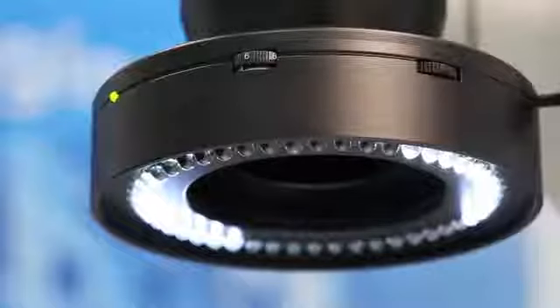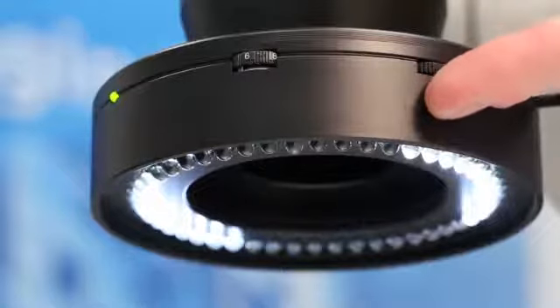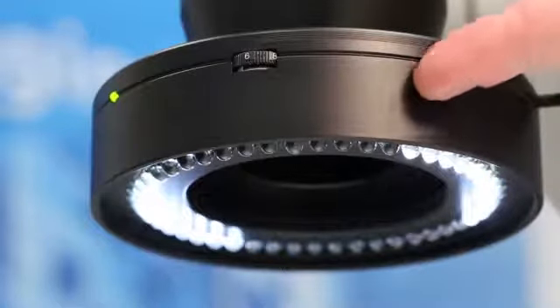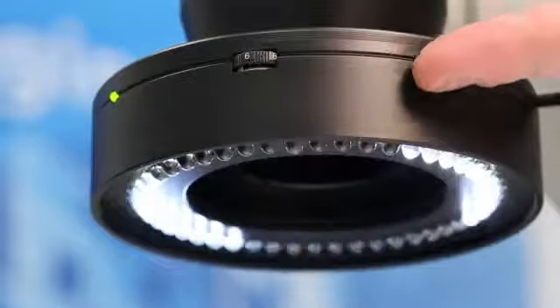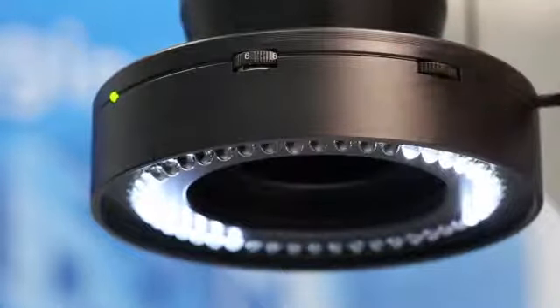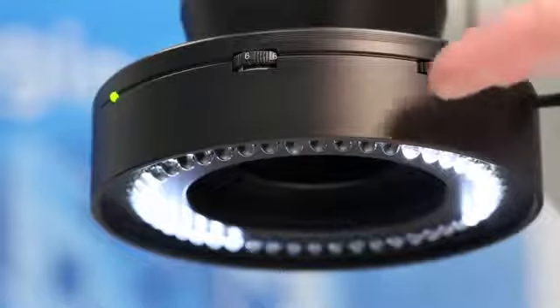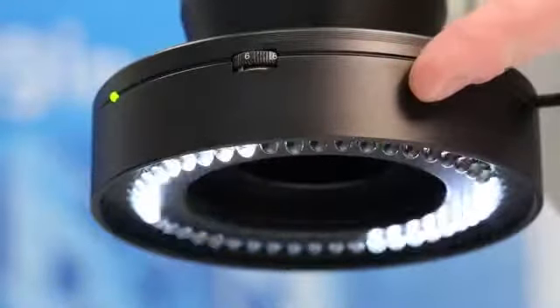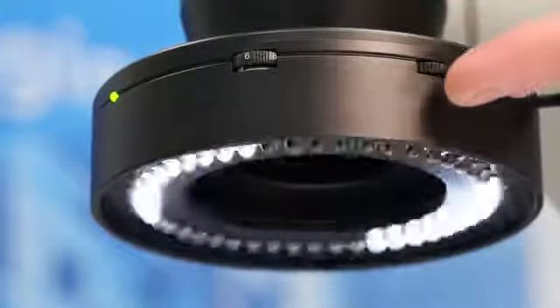By tilting the multifunctional control element to the very left or to the right, one can rotate the LEDs against the specimen. It takes four steps to return to the original position. Finally, by holding the control element longer than one second tilted to either the right or the very left, one starts a continuous rotation of the illuminated segment. Here we will demonstrate a right-hand drive. To stop, one simply has to touch the element again.